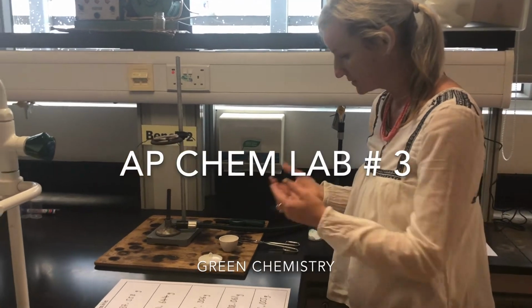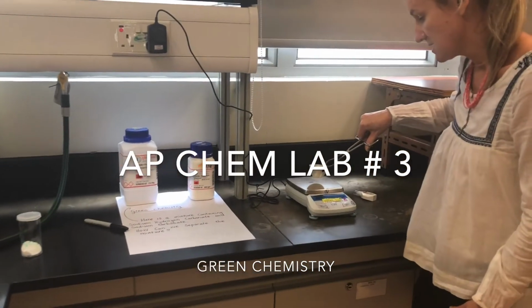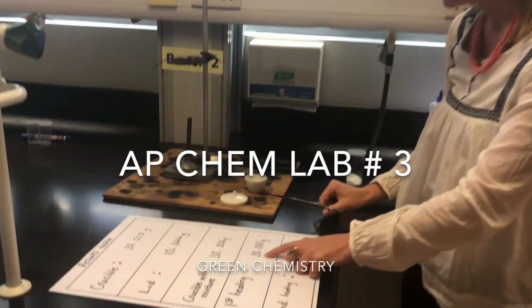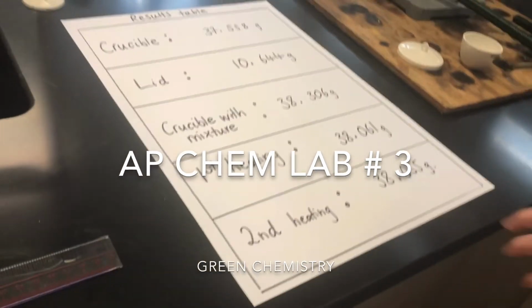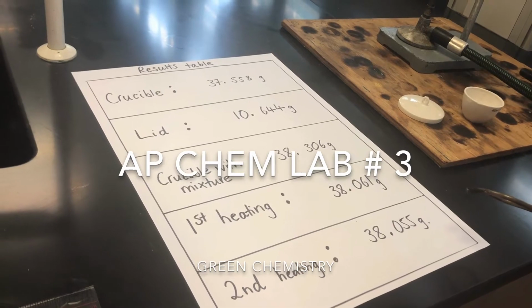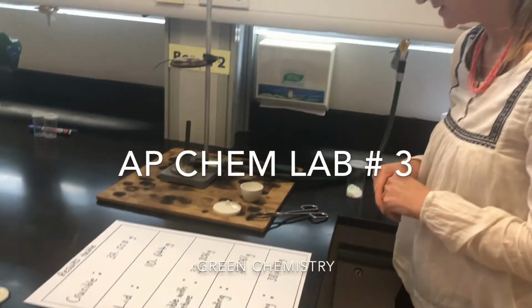Once it has cooled down, and I'm just demonstrating because this would take a period of time, I would go back, place it on the balance, and reweigh the substance. I would do that one or two times. After my first heating, I got 38.061 grams. This might take two or three heatings, but after my second heating, I could see that there wasn't a lot of change going on. Just by looking at the results, I can successfully assume that I've evolved most of the gases from this substance.